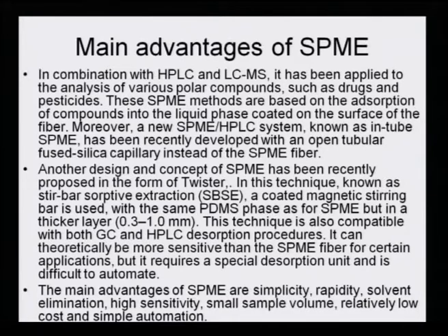Another design and concept of SPME has been recently proposed in the form of twisters. In this technique, known as stir bar sorptive extraction, a coated magnetic stirring bar is used with the same PDMS which I mentioned a little while ago, and this is acting as a phase for the SPME, but in a thicker layer. That is, the layer of that PDMS is almost 0.3 to 1 millimeter.